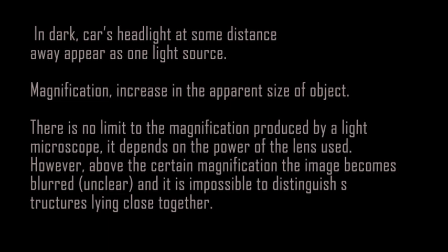No limit to the magnification produced by a light microscope. This means it depends on the power of the lens used.